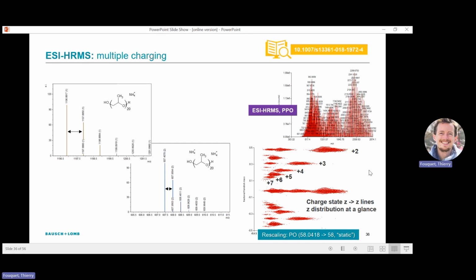A series at charge state plus or minus 2 will be seen as two lines in the plot. One line here, that's a plus or minus 2. Well, they're all plus here, so let's go for plus. I got 3 lines here, 1 line, 2 lines, 3 lines. That's a +3. I got 1, 2, 3, 4 lines here. That's a +4. 1, 2, 3, 4, 5. That's a +5. 1, 2, 3, 4, 5, 6, +6, and so on.